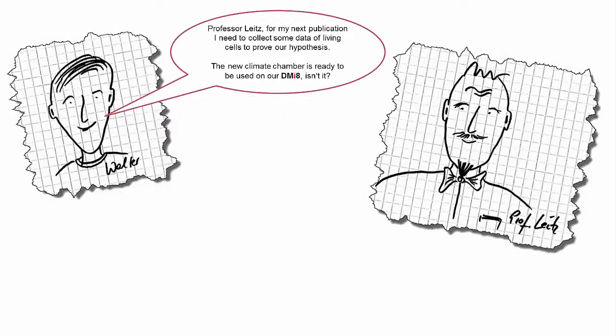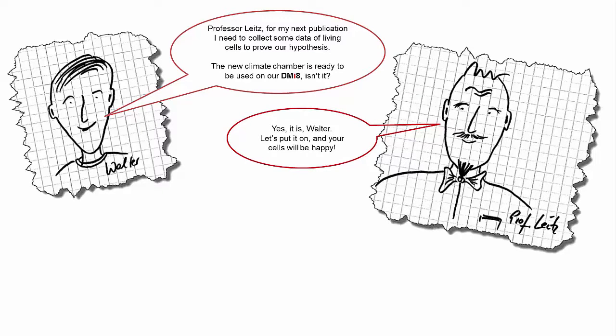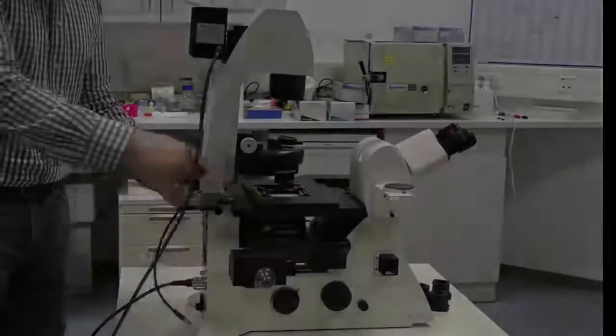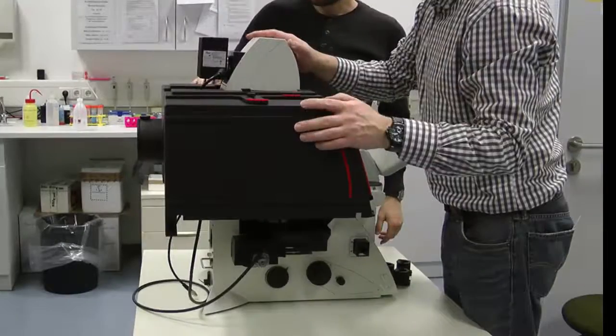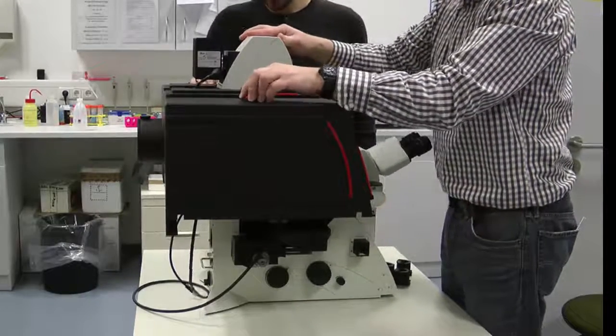Professor Leitz, for my next publication, I need to collect some data of living cells to prove our hypothesis. The new climate chamber is ready to be used on our DMI8, isn't it? Yes it is, Walter. Let's put it on and your cells will be happy. Adding climate control to the Leica DMI8 is easily done with modular components that are quickly added to the system.